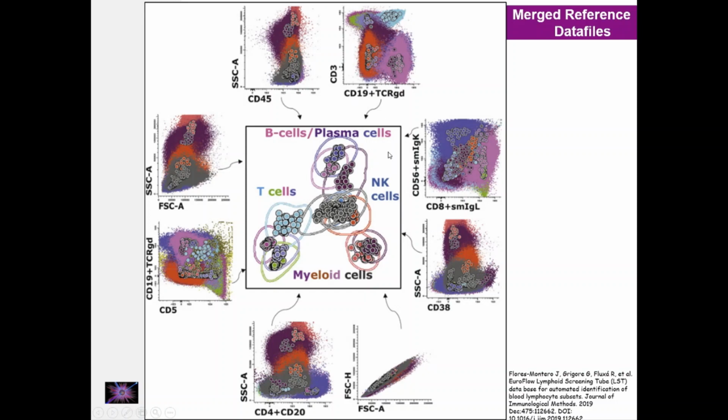And in the center you can see the clustering, the canonical clustering analysis, which is only represented by the larger circles. Every single one is, of course, one population, as it represents the color of the population. It's one population, and in each of the 46 databases.